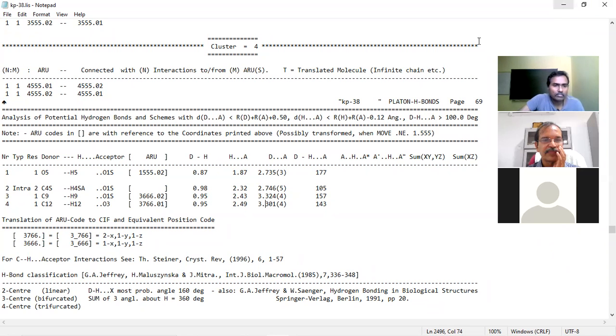Sir, so selecting the hydrogen bonding, is it only by that angle, or can we use the distance also? Distance also, yes. So for DA, what should the distance be, minimum or maximum? We cannot say much, but if it is around 4, we can surely neglect it. If it is 3.1 or 2, then we have taken it. Even 3 we have considered. That depends on the case. If there are few interactions, then we have to consider this. If there are many other interactions, then we can consider it as weak forces. Here we can consider this.